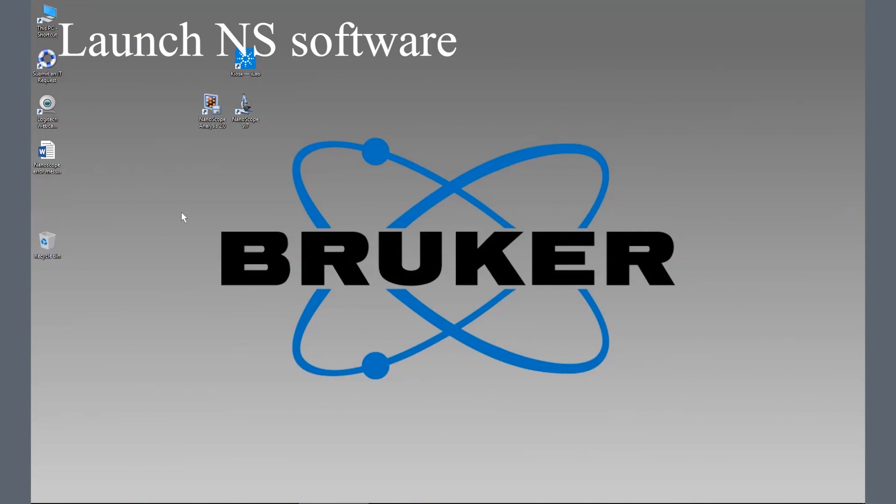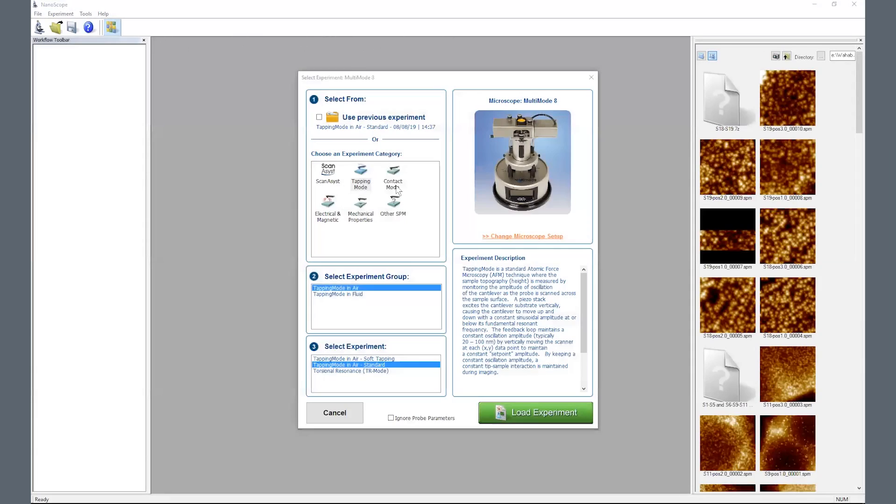Launch the Nanoscope software from the desktop. Choose your mode of operation from the experiment category and load experiment. For the video, we are using tapping mode in air.